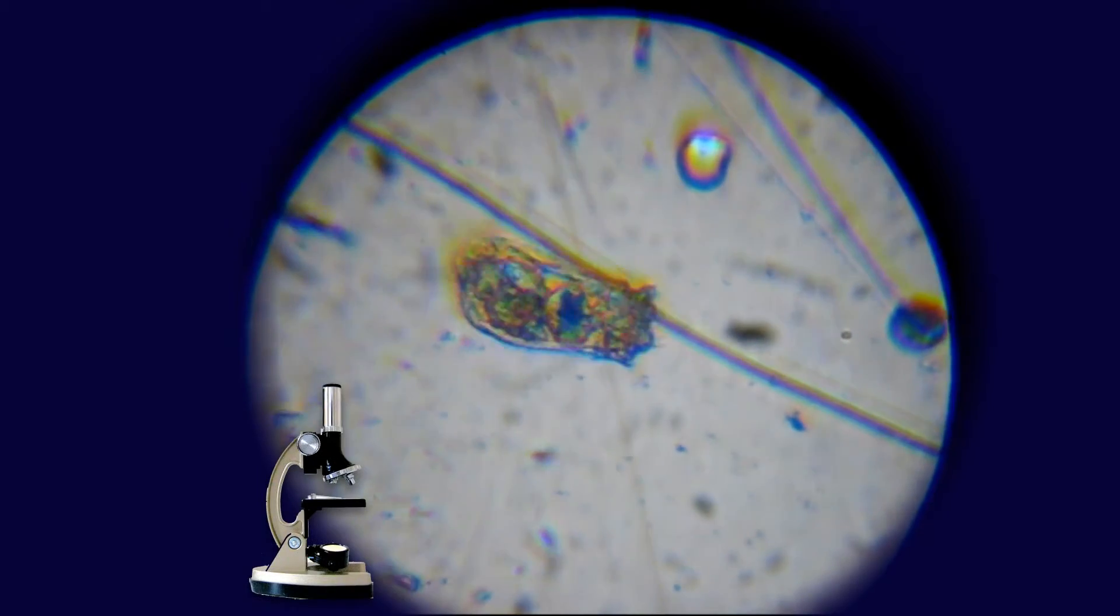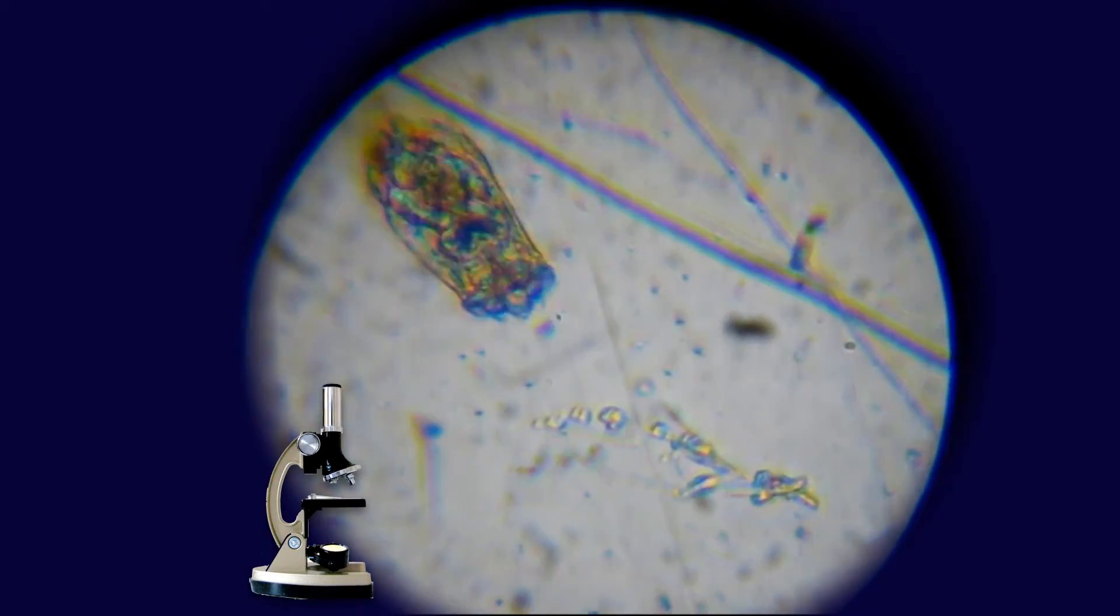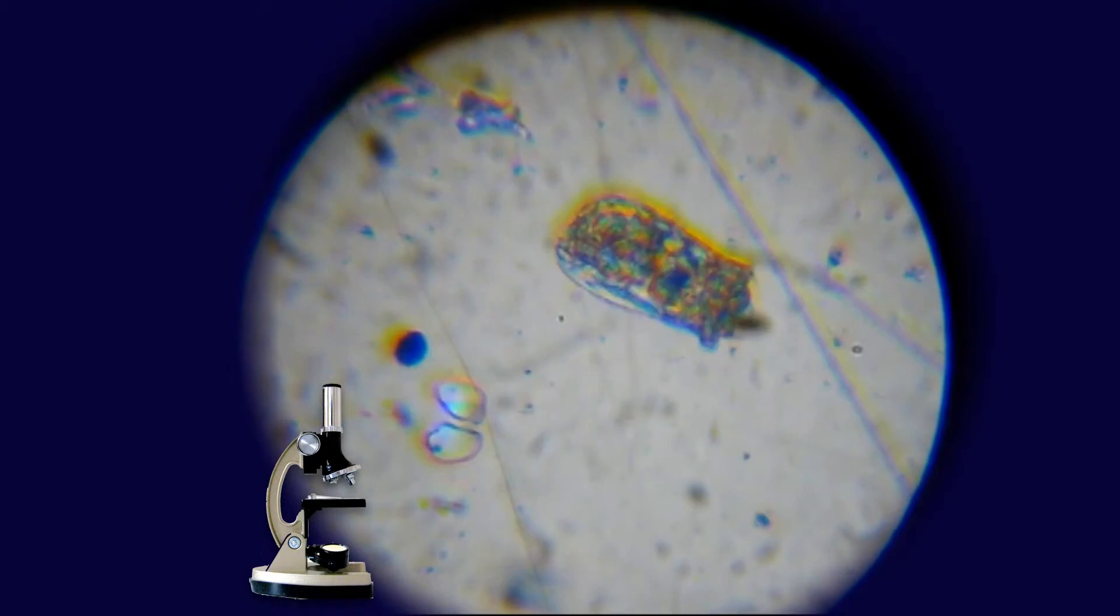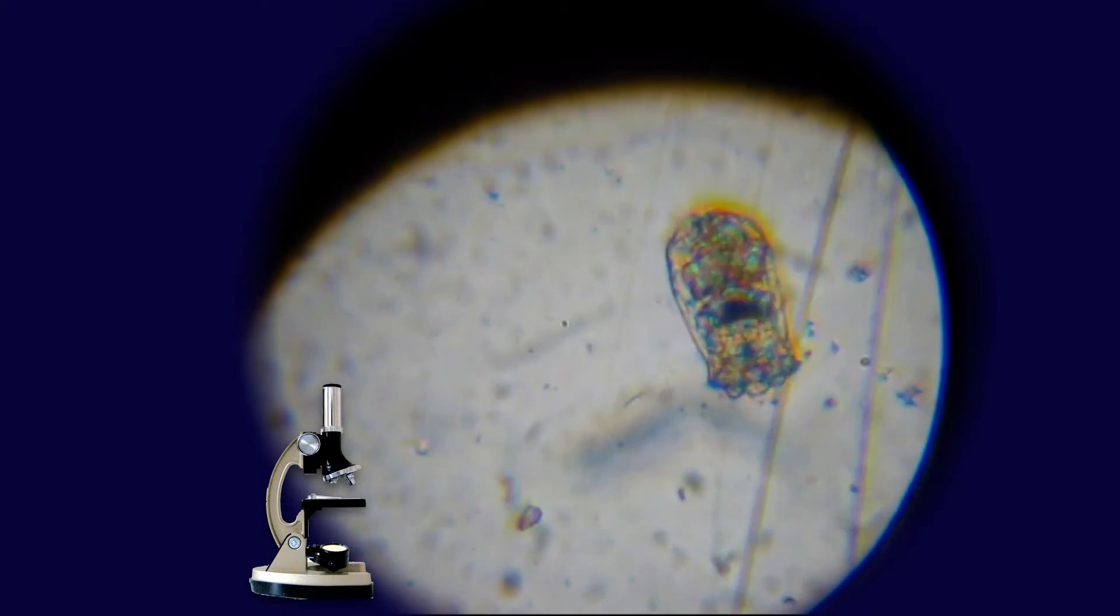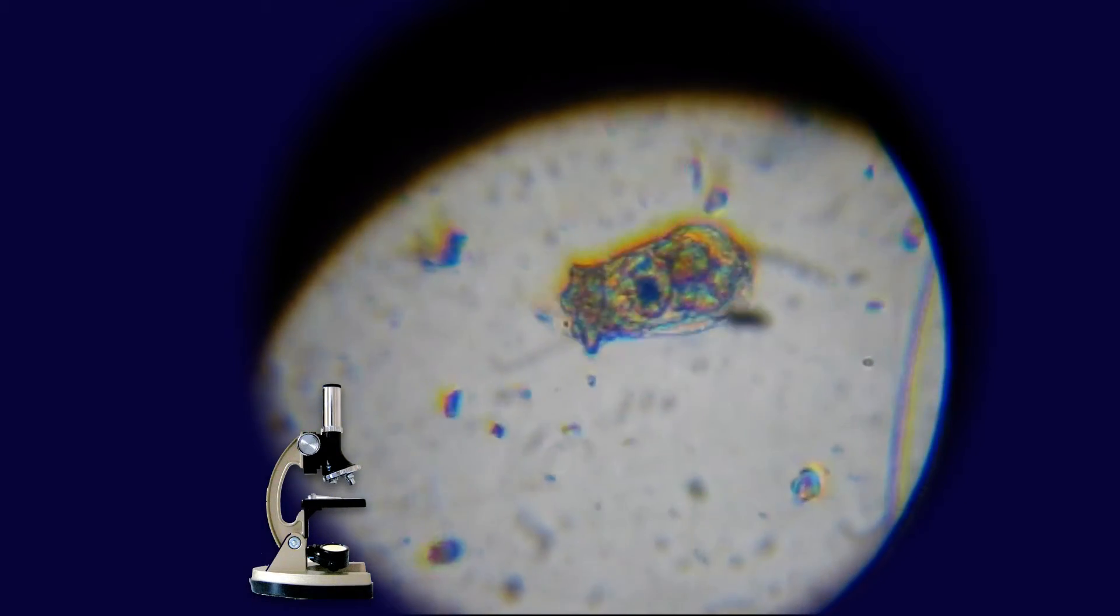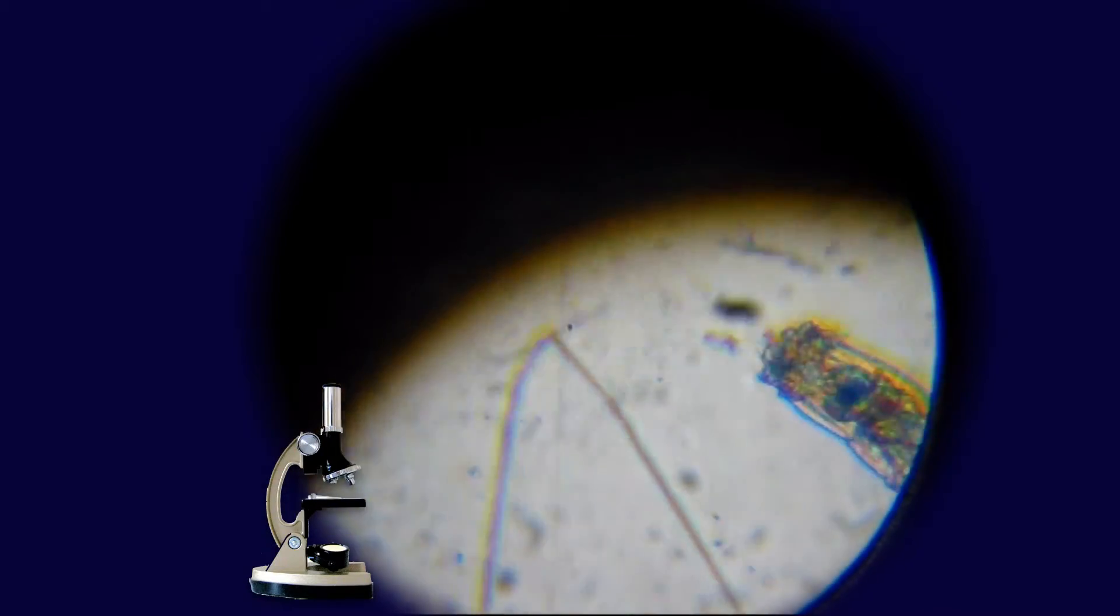So these animals are called wheel animals, or rotifers to use their slightly posher name. And they're called that because their front end, it looks as if they've got a wheel spinning round. Now actually that's got tiny little hair-like things called cilia which spin round and let the animal move through the water. So I guess they're not technically wheels, but they do look a bit like it, don't they?